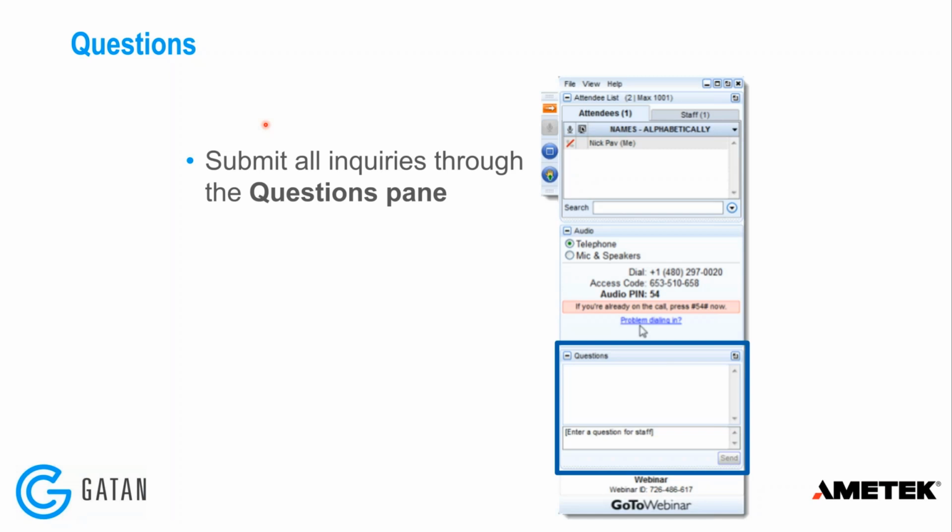There was a question about whether, if you don't have all the elements, you can use computed cross sections and standards at the same time. Yes. When you measure the standards, the standard becomes one of the available choices of cross section when you're doing the quantification. So you can still choose Hartree-Slater, and you can mix and match Hartree-Slater, hydrogenic, or standard. Okay, that makes sense.